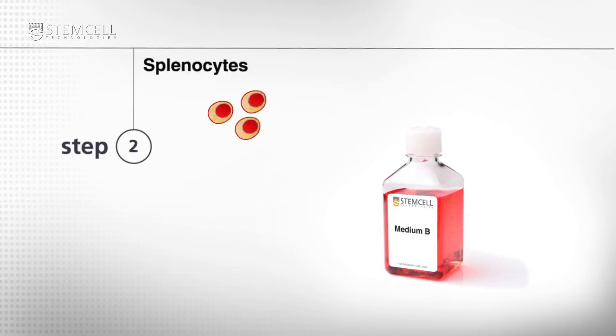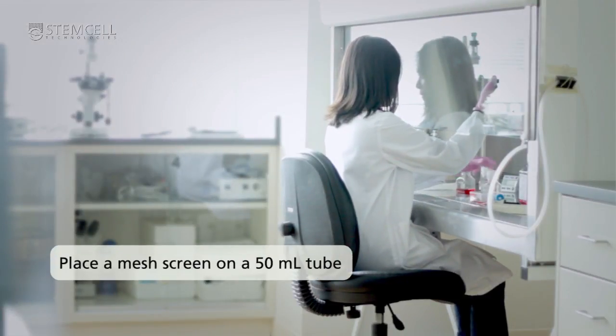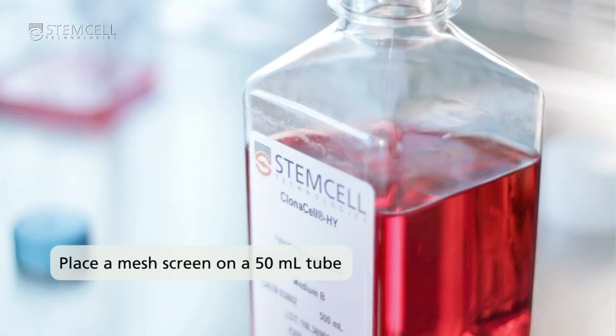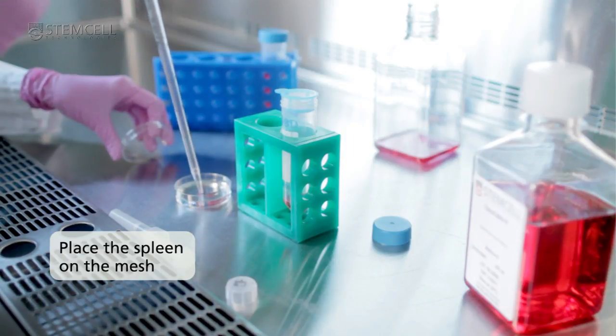To prepare splenocytes, disaggregate the spleen into a single cell suspension. To disaggregate the spleen, place a mesh screen on top of a 50 mil conical tube. Pre-wet the screen with 5 mils of medium B and place the spleen on the mesh.